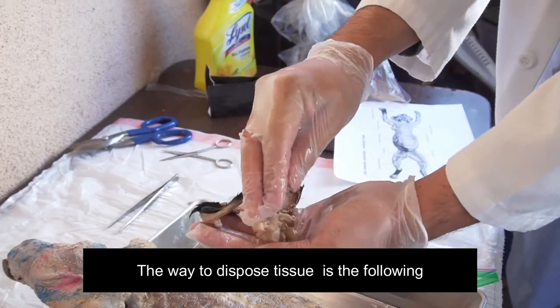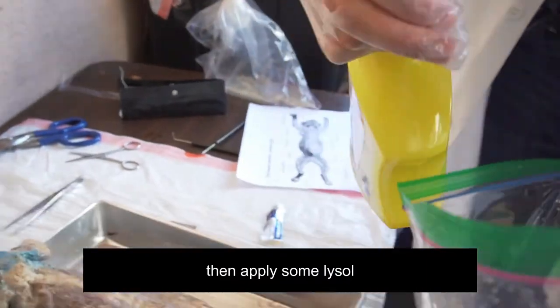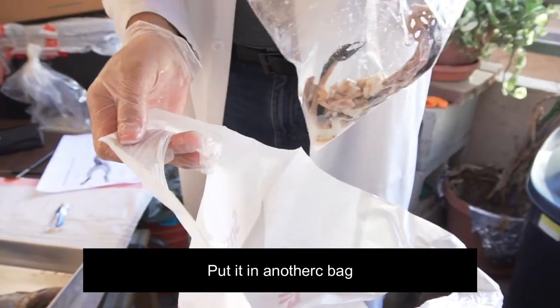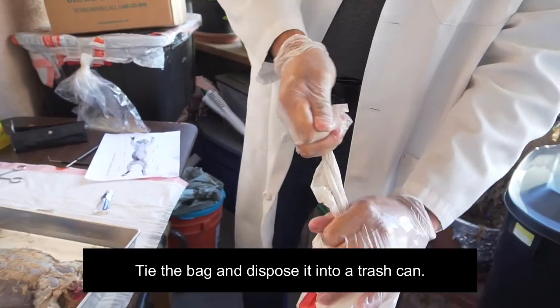The way to dispose of tissue is the following: put it in a plastic bag, then apply some Lysol, seal the plastic bag, put it in another bag, tie the bag, and dispose of it into a trash can.